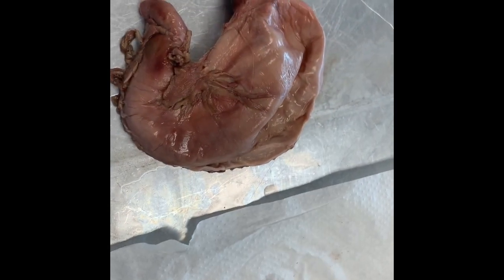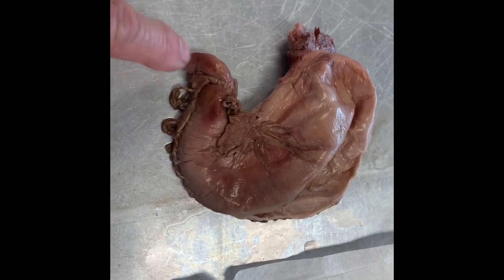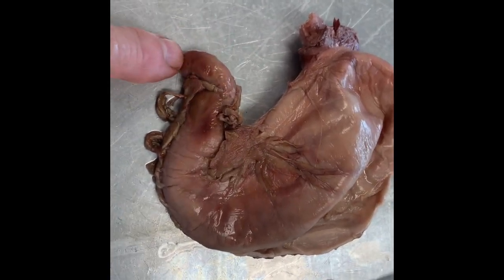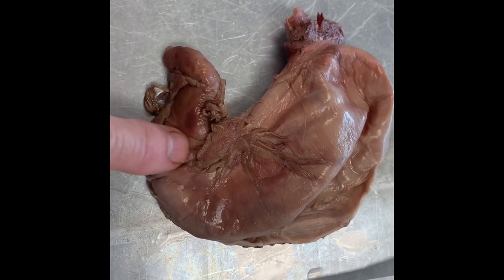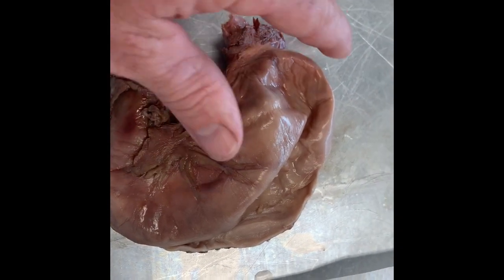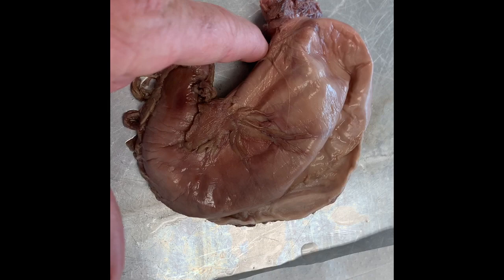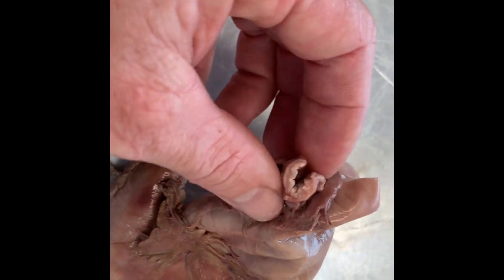And then here is the stomach. I just rinsed it out. And let me go over the parts again. So this right here is the duodenum as it exits out of the stomach. This is called the pylorus, which is another chamber. This is the fundus. This is the greater curvature. This is the lesser curvature. And then this small tube is the esophagus.